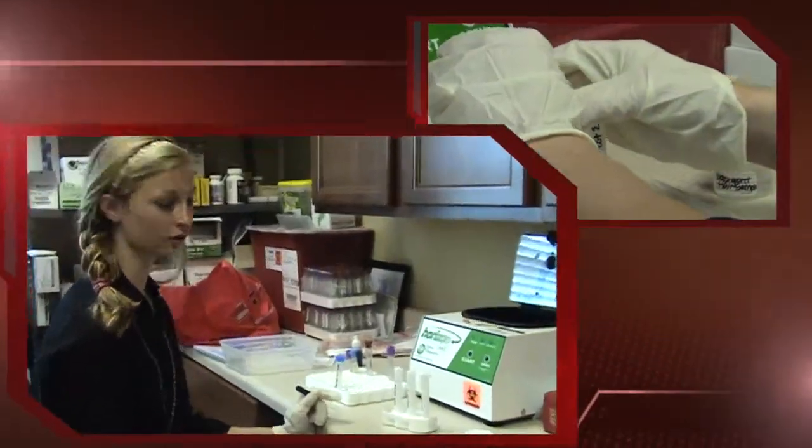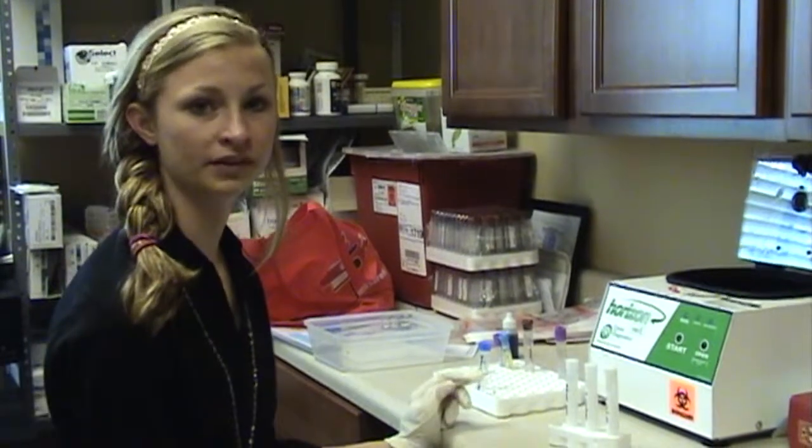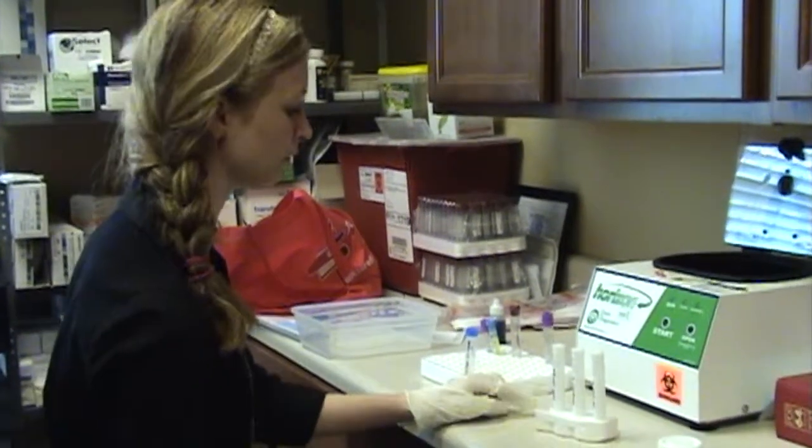I will now place the restriction enzymes, which cut up the DNA into smaller pieces, into each of the test tubes.